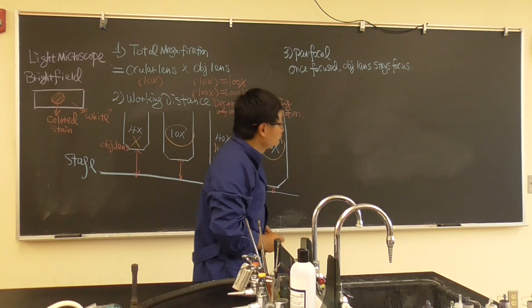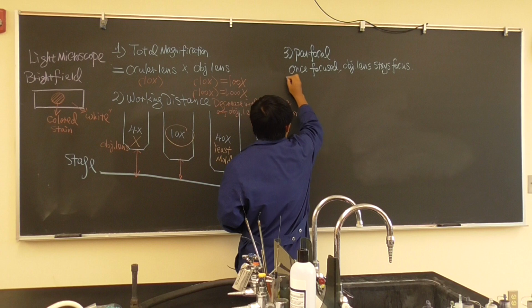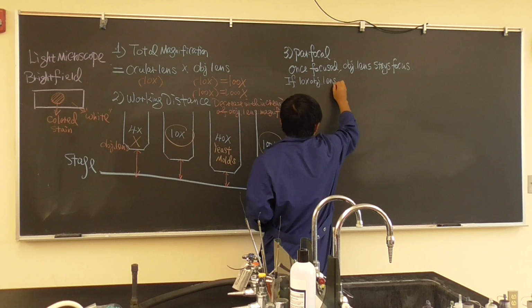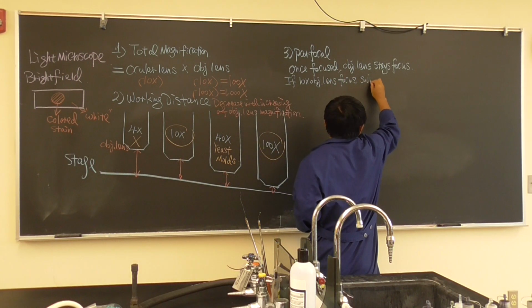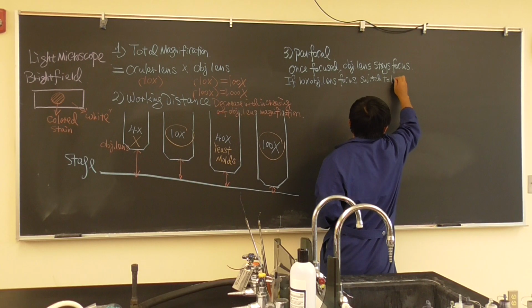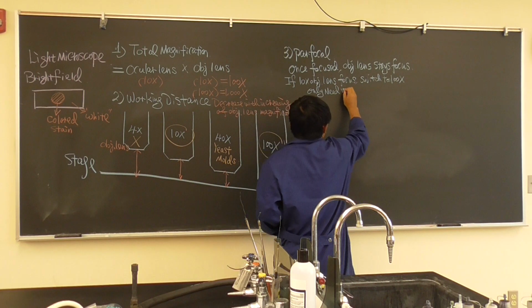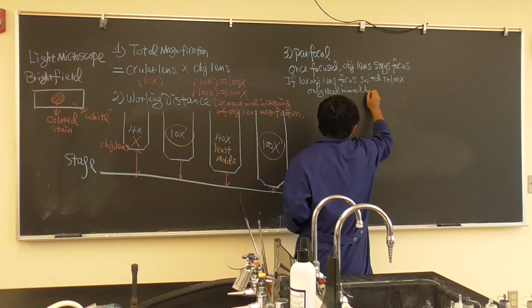Very simple. So if you want to put this in other words, it means if the 10x objective lens is focused, then when you switch to 100x, you only need a minimal adjustment.